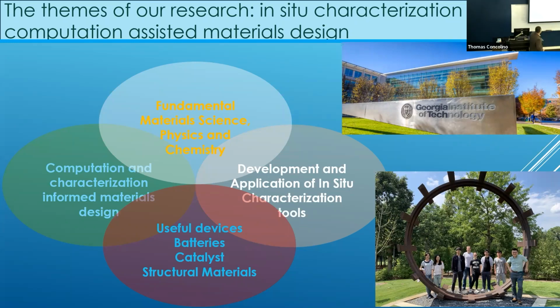What we do is material design: new materials, new compounds, mostly inorganic solid materials, and the applications, in recent years, are mostly battery materials, but we do a little bit of catalysts and structural metals and alloys. Our major technique expertise and tools are building different kinds of in situ and operando tools based on X-ray and neutron. Hopefully I'm going to show you just two examples of how we are using operando and in situ characterization in our research.